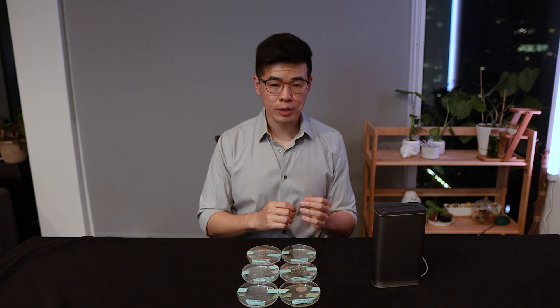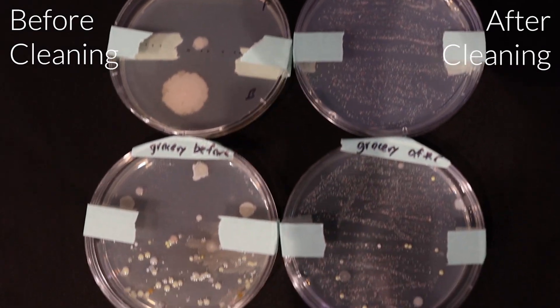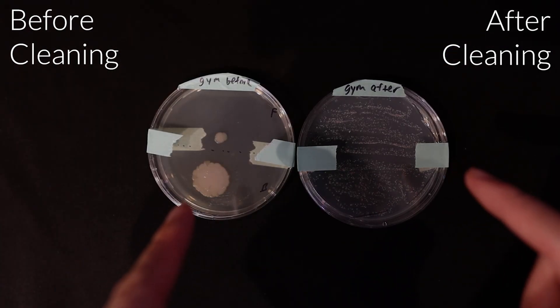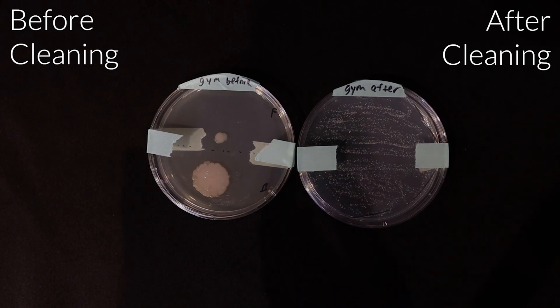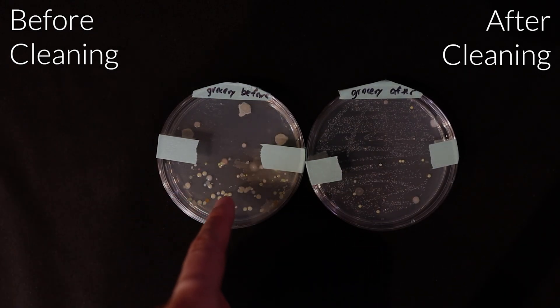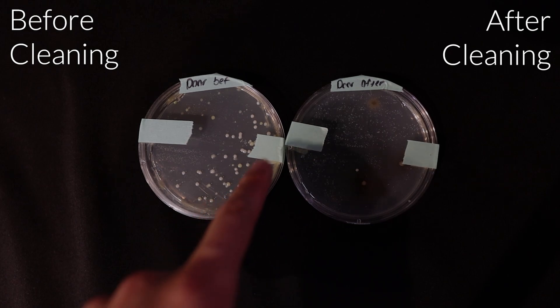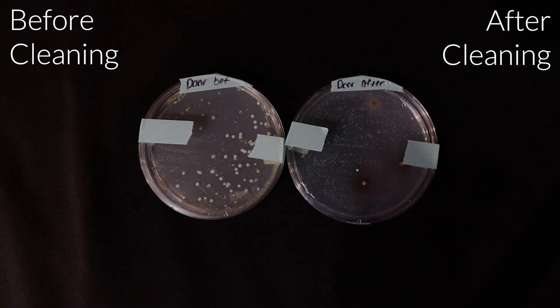In all 3 test scenarios, the bacteria gathered before running through the Clean Station showed more growth than the bacteria after. Let's do a close up. Here we have the gym before and the gym after. With the gym before, you have large bacteria growth, while the gym after shows a bunch of small growth. The grocery store before also looks much worse — it seems like a lot of bacteria was sticking to the back of the phone. With the door test scenario, door before shows a lot of bacteria growth all around, door after only has a couple dots versus a couple dozen, so the Clean Station worked really well there.